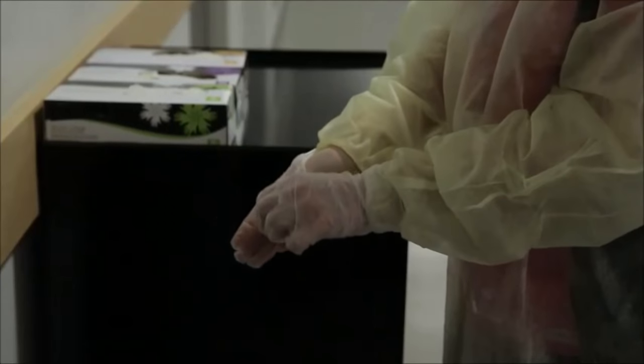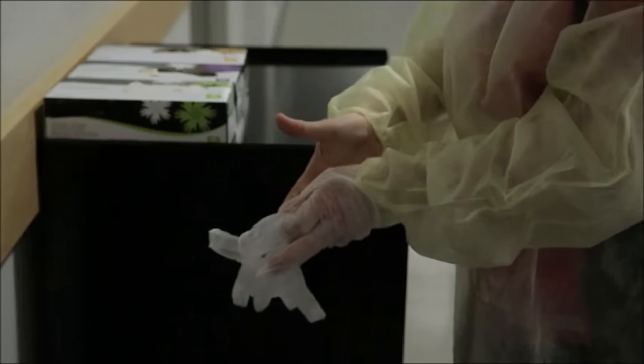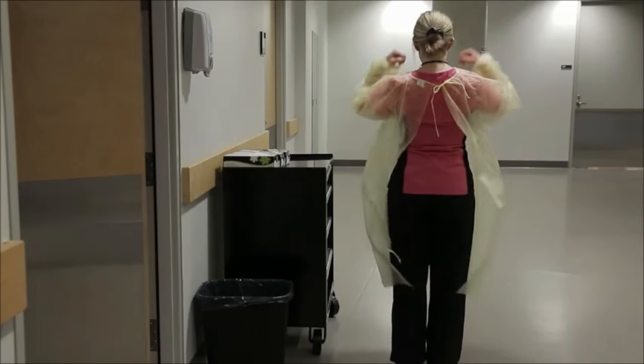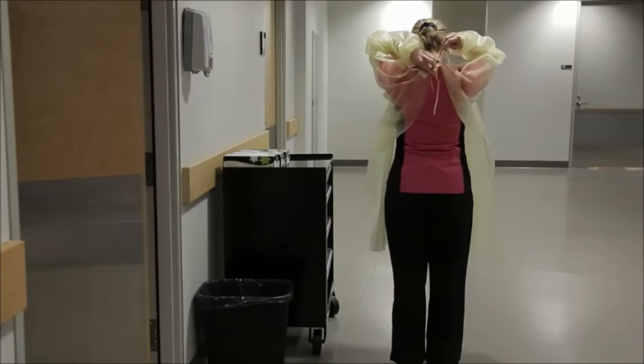Remove gloves first and discard into the garbage. Remove the gown by untying the waist strings and then the neck strings.